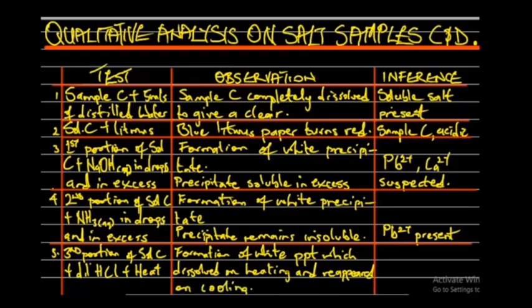So this confirmed to us that we have lead present in that substance.